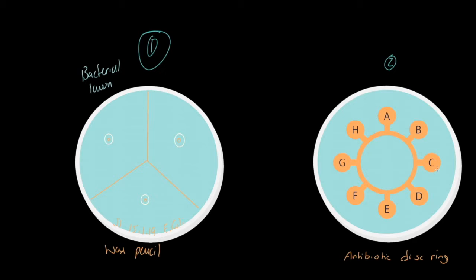So of course, once it's sat on top of our blue bacterial lawn, same on this side, we can look again at the zone of inhibition. A nice way of remembering that, if you want to, is you can call that your Zoe, your zone of inhibition. The idea is, to what degree does, for example, antibiotic B prevent growth and replication of the bacteria which has been spread with this blue bacteria.